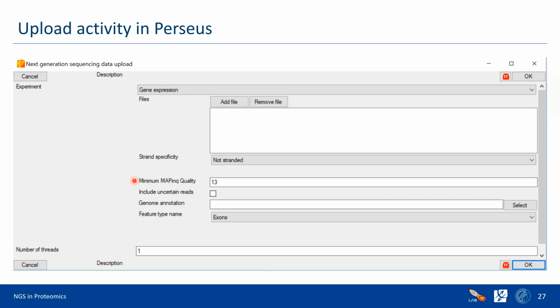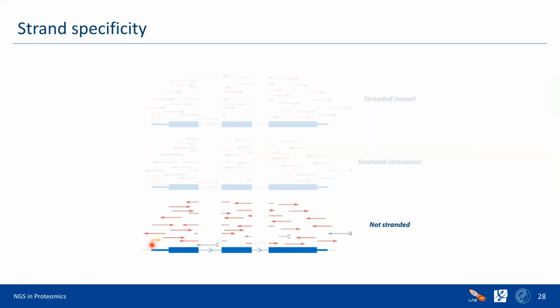You can specify many parameters, including the genome annotation, like where each gene stands in terms of positions. There are many parameters here, including the number of threads. You can make it multi-parallel, and as a result you get results really quickly. We'll discuss that, but before that, let's introduce a few things.